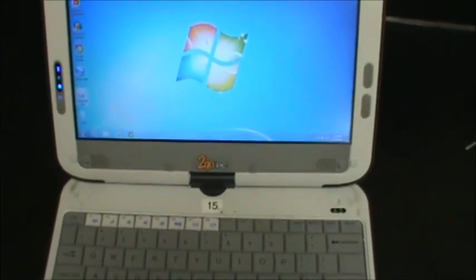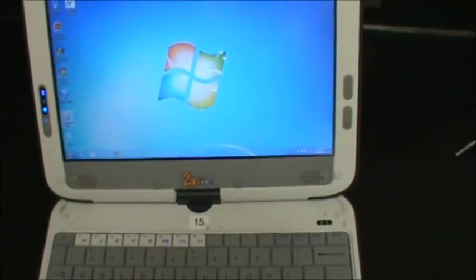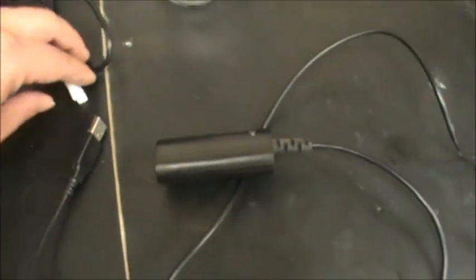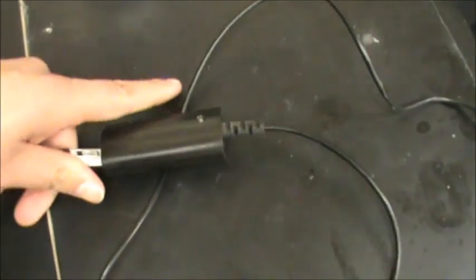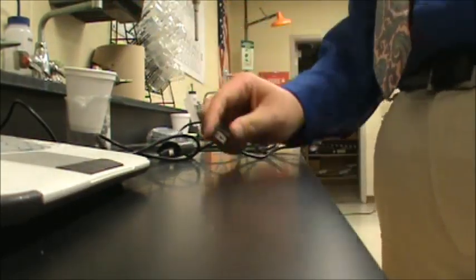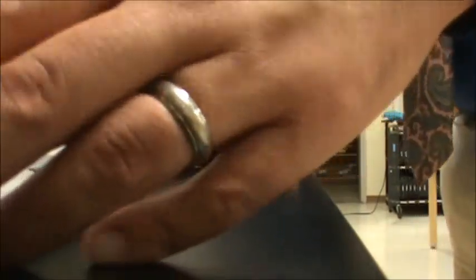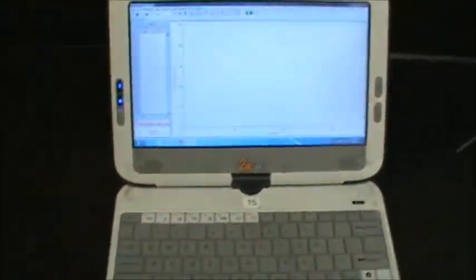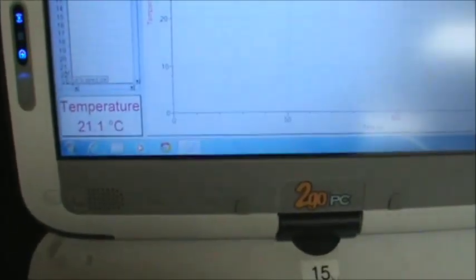I open up the program right here and it opens up Logger Pro, then I hook up all of my equipment. I have a temperature probe sitting right there, and I plug that directly into the interface, which is basically how it communicates to the computer. I plug in my USB cord into my computer. Now it's reading 21.1 degrees Celsius — that's the temperature of my temperature probe at the moment.